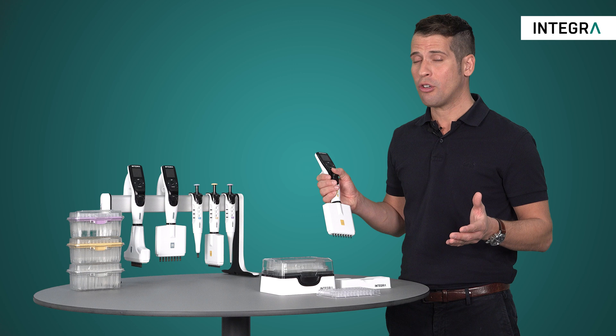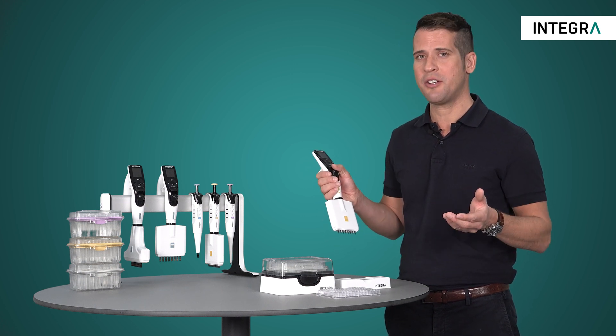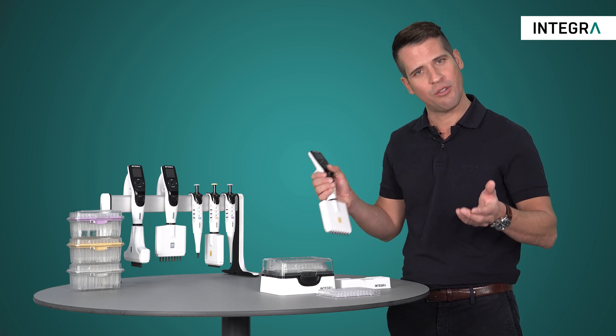If you're doing any mixing in your lab, pipette mix mode with the Integra electronic pipettes will make your work much easier and improve the consistency of your results.